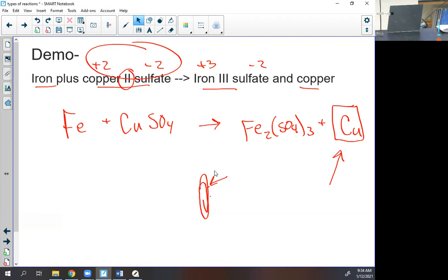Oh, I'm trying to be so cool. And ooh, it feels kind of good, actually. Copper is really small, so it fills in the pores. And then your fingers feel like they have no fingerprints. Maybe I could go rob a bank right now. But then it shows every crack you've ever had in your life in your skin.